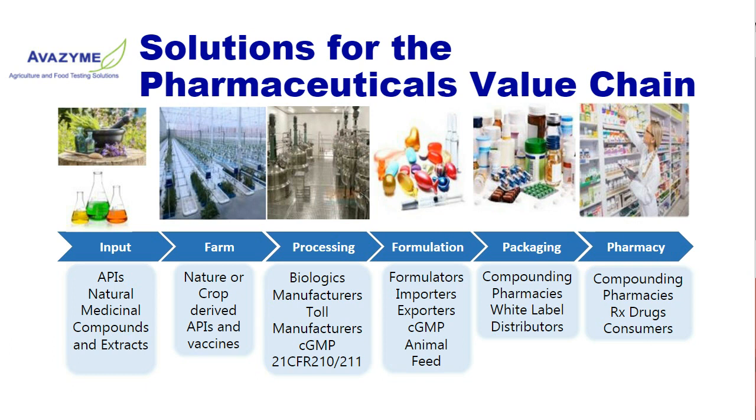And this includes, for example, the water that's being used, and sometimes comes from city water, and their heavy metal content is important to monitor, but also potential intake of chlorine in unacceptable levels, because a lot of the city water is chlorinated.